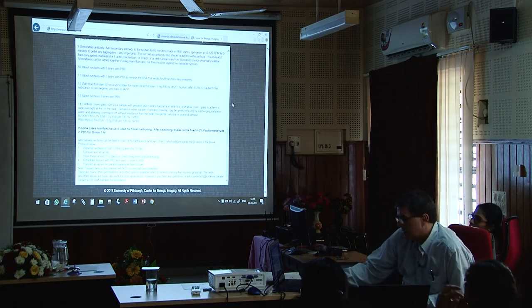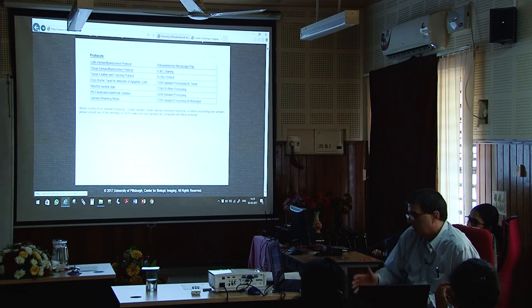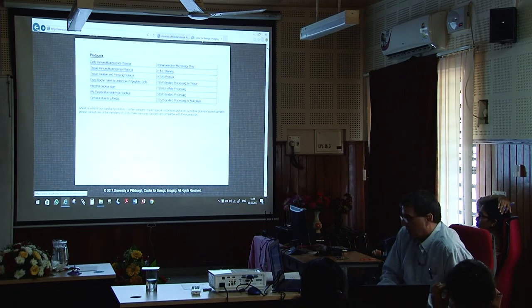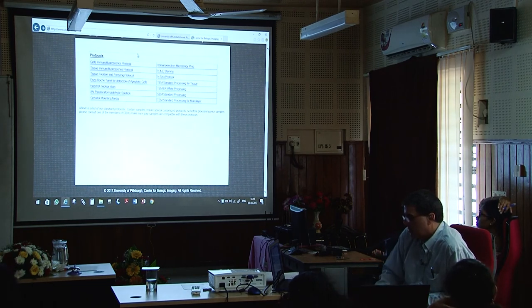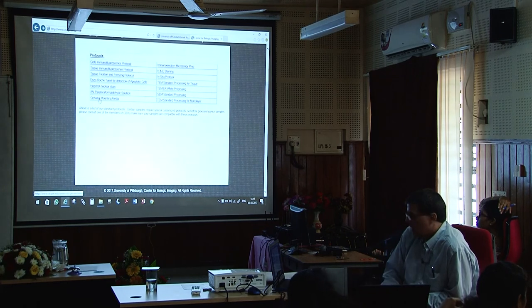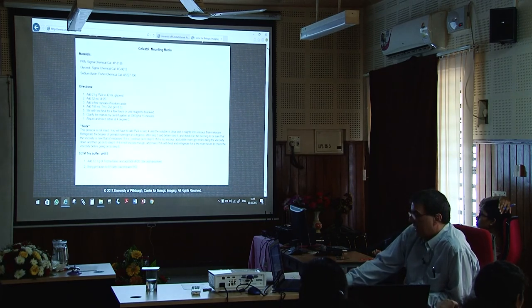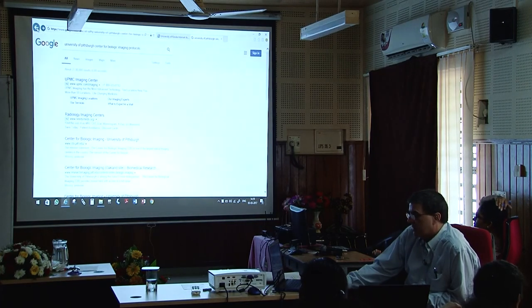Like I said, this is a nice website, and these are basic protocols. There are variations you might have to do to make your stuff work, but in general, these are nice protocols. They have an H&E staining protocol here, like we talked about for pathology. And they've also got what they call Gelvatol, which is their idea of a mounting media. You can make it yourself, or you could buy VectaShield or ProLong Gold or some type of mounting media like that.